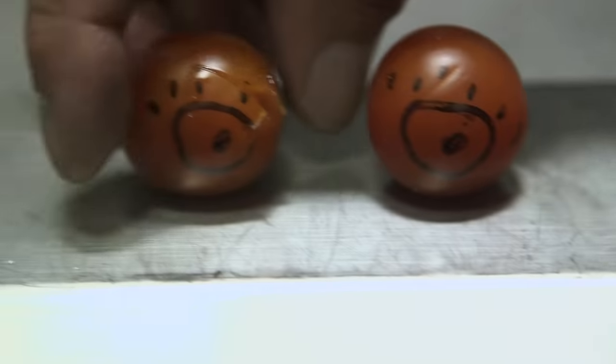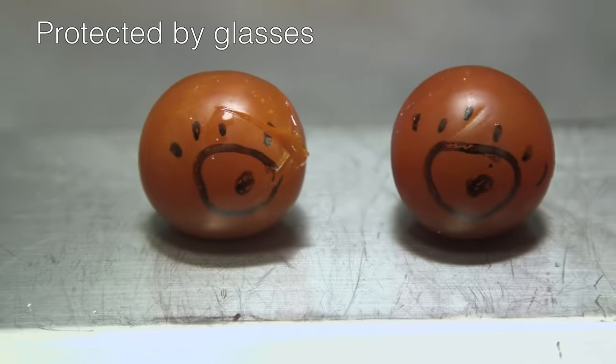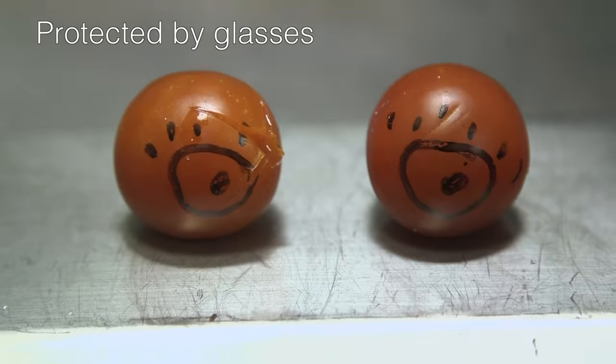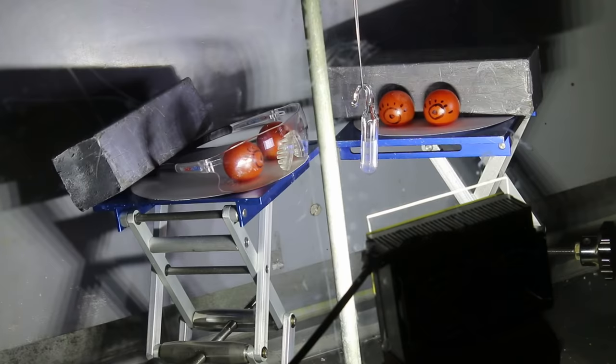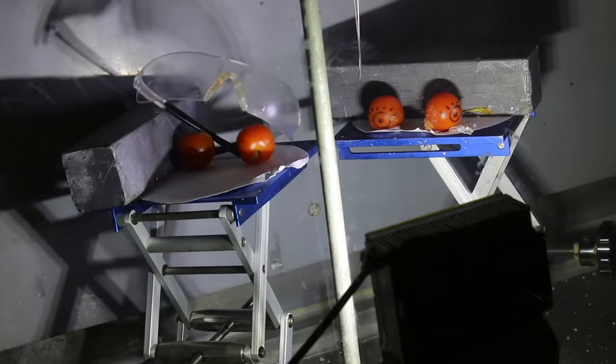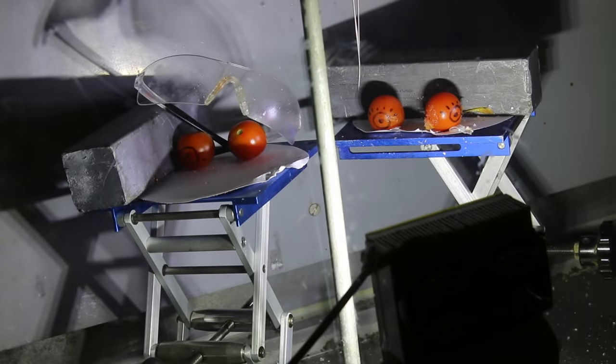In this case, the eyeballs with safety glasses were slightly damaged because the explosion blew the glasses up. And of course, in our simulation there isn't a nose, so some of the glass got through the gap where you would normally have your nose.